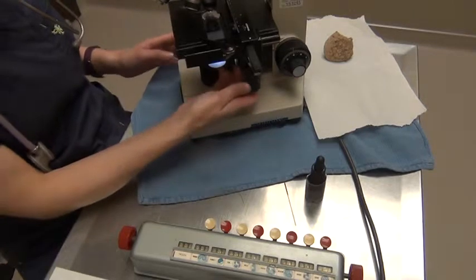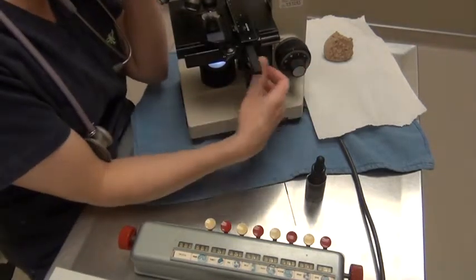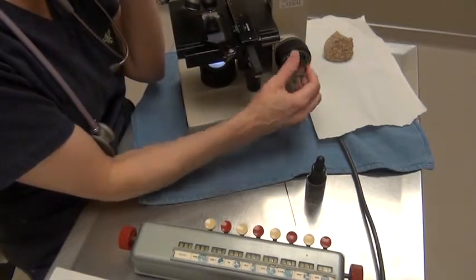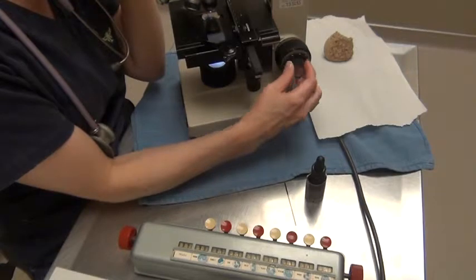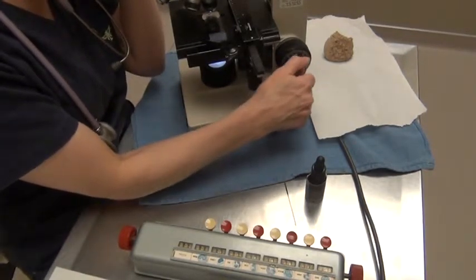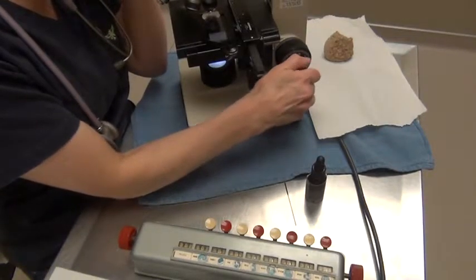So I'm going to go ahead and turn it on, and I'm going to focus at 10. And this is just to get a focus. I'm not going to do any kind of counting here. So you'll be focusing on the cells at this power. And once you focus in at this depth, you're going to go ahead and move to 40, which I have done.